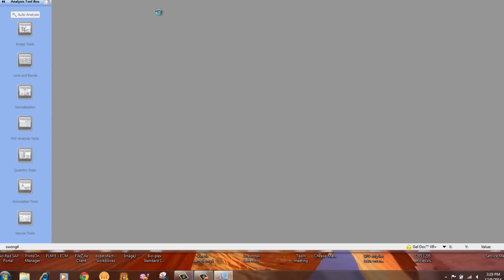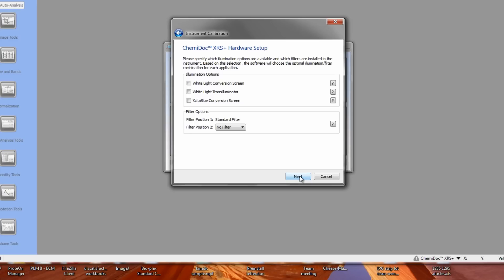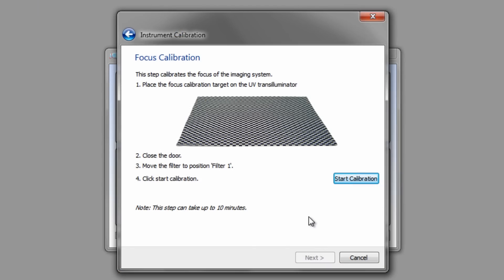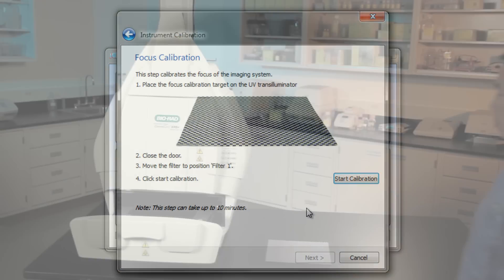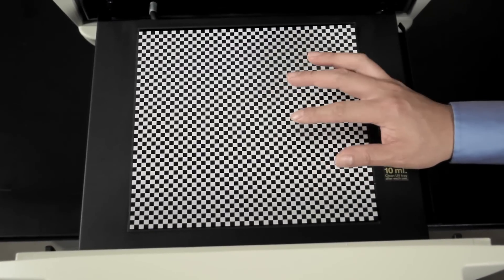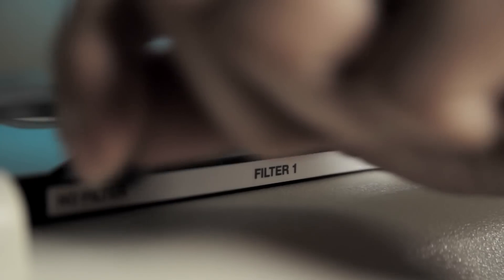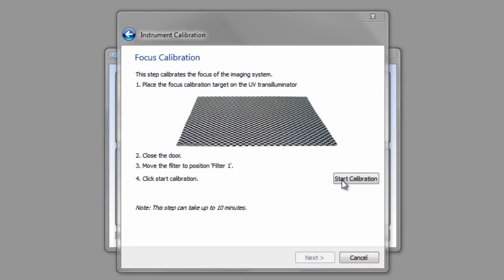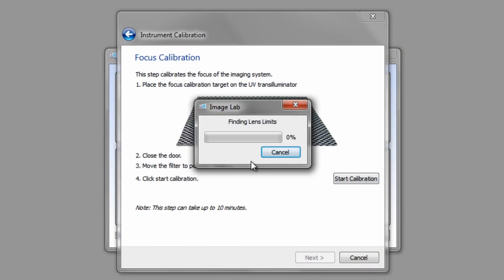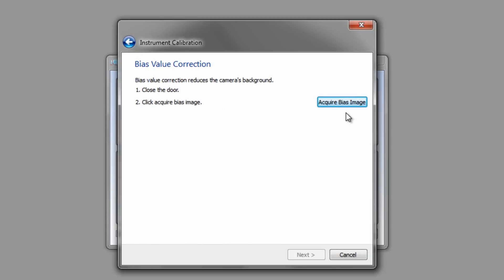Open ImageLab and start calibration of your system. Choose which illumination accessories and filters you have. The extra accessories will arrive in separate boxes from the system. When prompted by the software, insert the focus calibration target from the installation kit into the imager, ensuring the target borders are parallel to the transilluminator edges and the target corners are flat. Move the filter to position one. You may have to carry out the focus calibration twice if you have a white light conversion screen or excite blue screen.